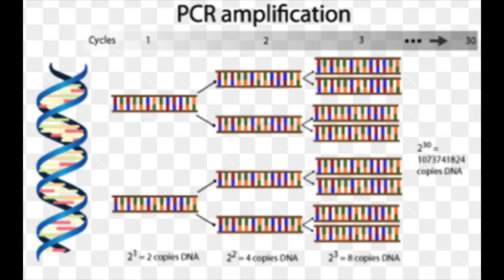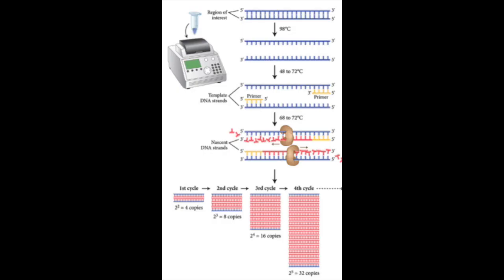When performing a PCR, one has to take care of several things, including pre-PCR activities, which include protocols and equipment necessary for nucleic acid extraction. Sterile and contaminant-free reagents and working space, as well as good care during sampling, are critical for a PCR reaction.